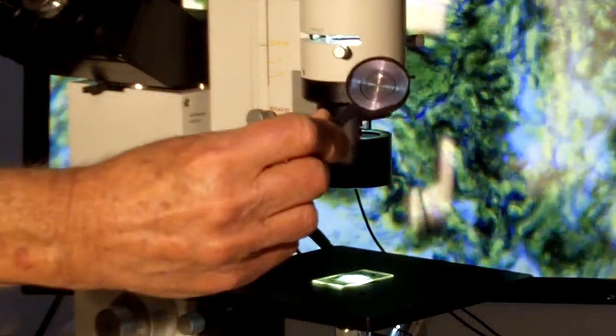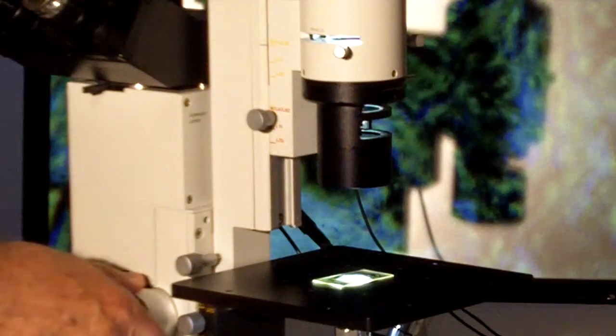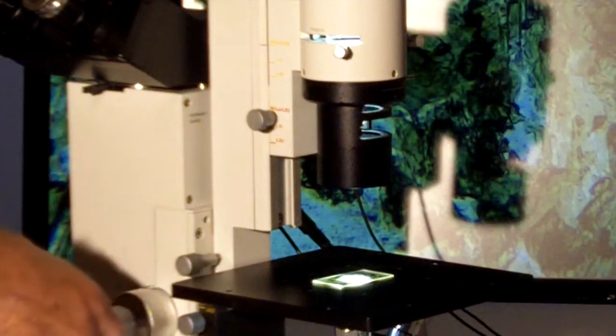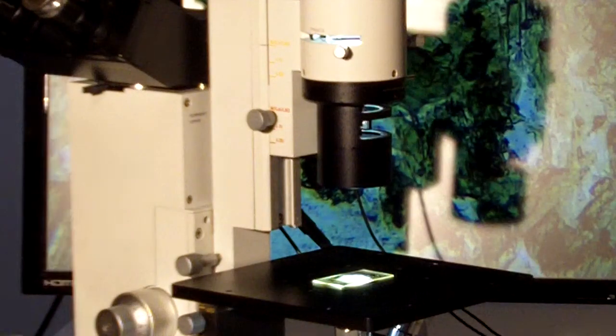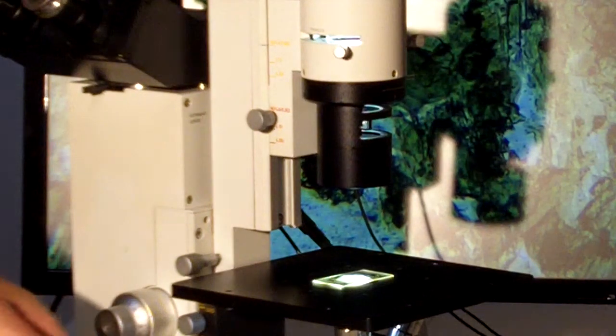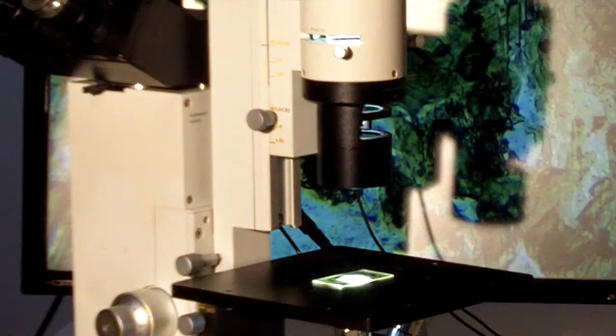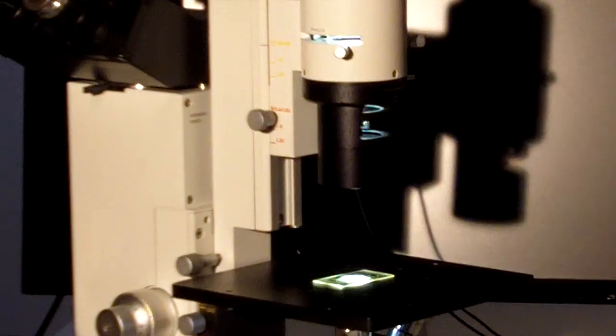This is a thin mineral section. We're going to add polarized light accessories. The first component goes right behind the objectives and that is called the analyzer. Aside from darkening the light because it's a polarizing film, it's still bright field.